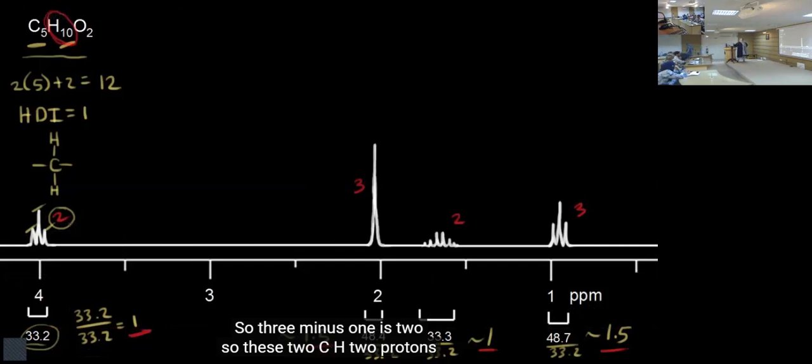Now you know this, looking at the spectrum, okay? So the number of protons is 3. The red color are the number of protons which comes from integration values, okay? The intensity. And integration is also mentioned on the back side of your proton NMR spectrum. So you can also calculate the exact number. Okay, so here there are 2 protons and it's a triplet.